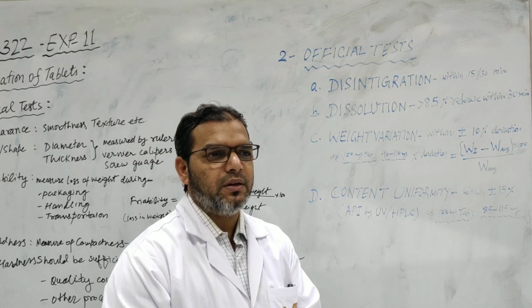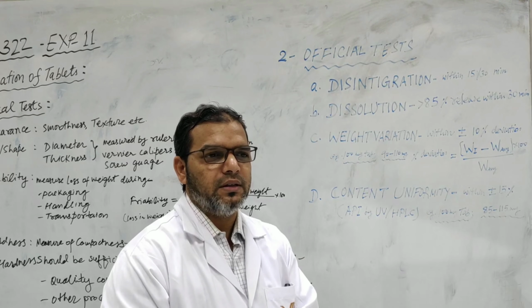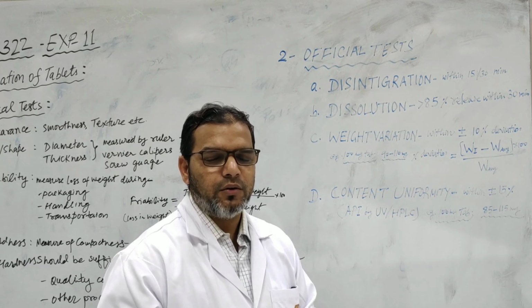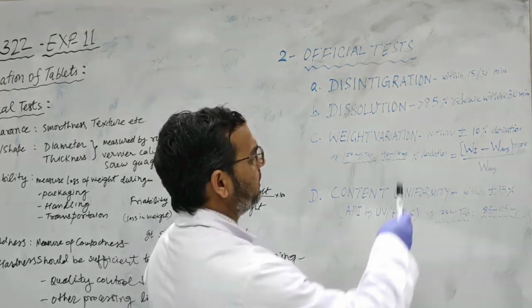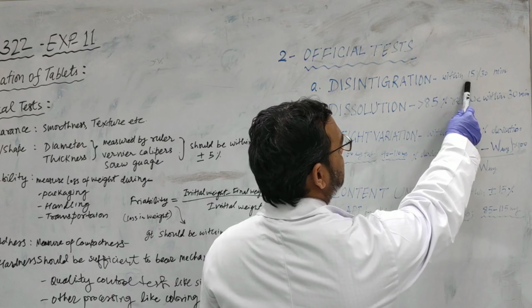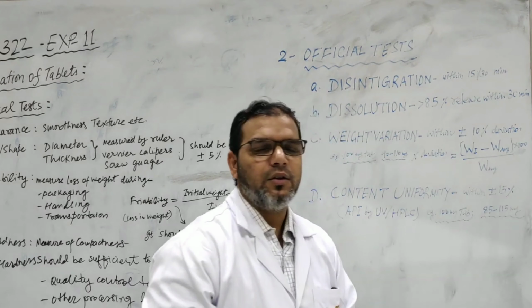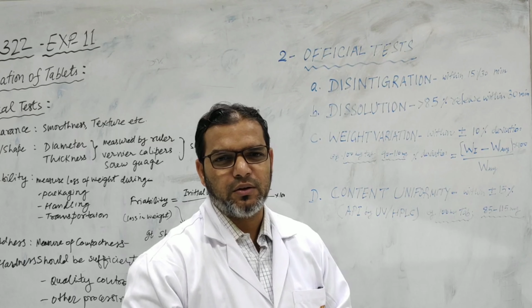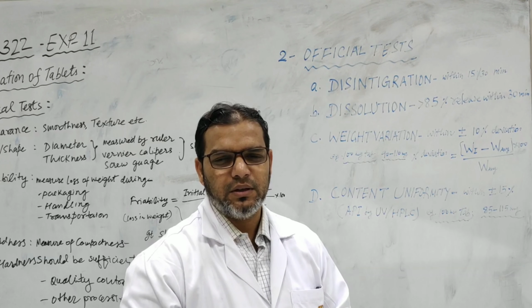Usually the time limit for this test is 15 to 30 minutes, sometimes even more. It depends on the type of tablet, and also on the country; it is something different also. But usually for a normal tablet it is 15 minutes. Okay, normal tablet 15 minutes, and coated tablet like film coated or sugar coated within 30 minutes.